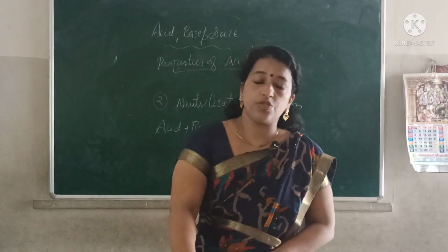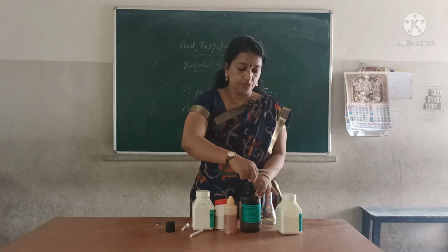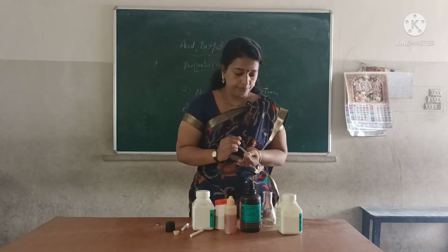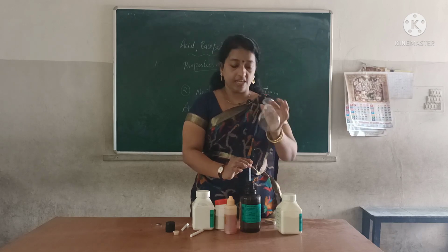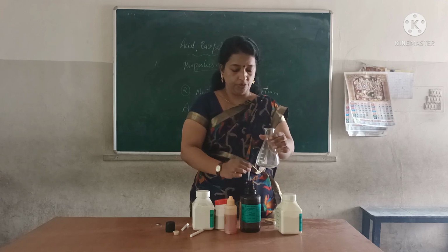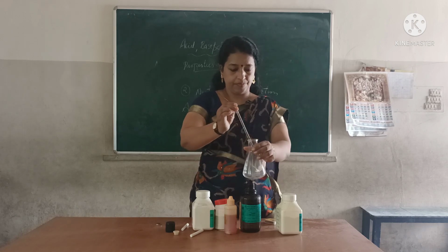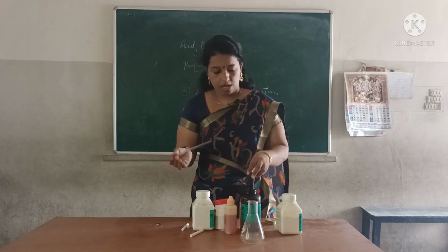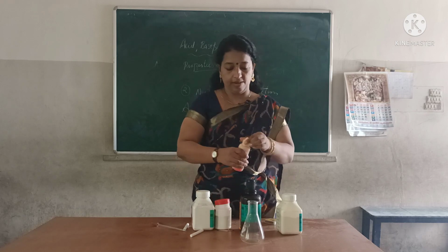Then we can prove this neutralization reaction also with an experiment, right? I think you are more interested to see the experiment than the explanation, right? That's why I am doing the experiments also, to make you more interested in chemistry. So I have taken one conical flask. Again, I am pouring some HCl, hydrochloric acid, into the conical flask, right? Now I'm going to pour some methyl orange into the conical flask.